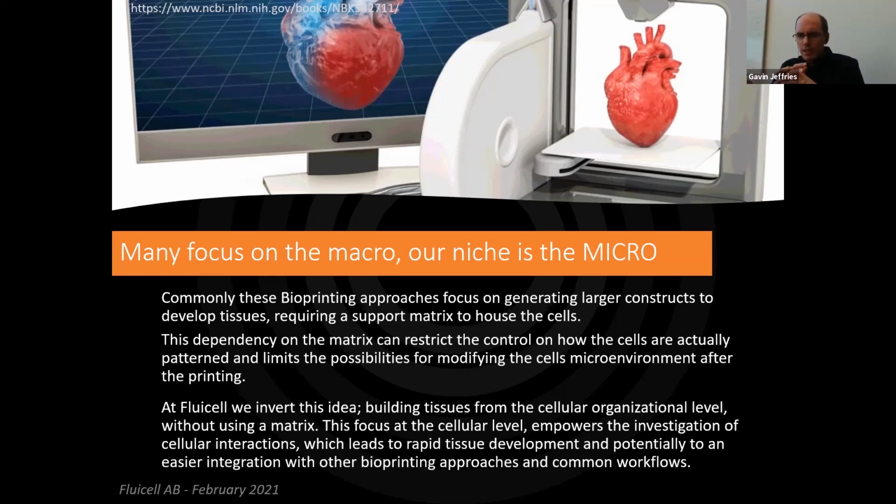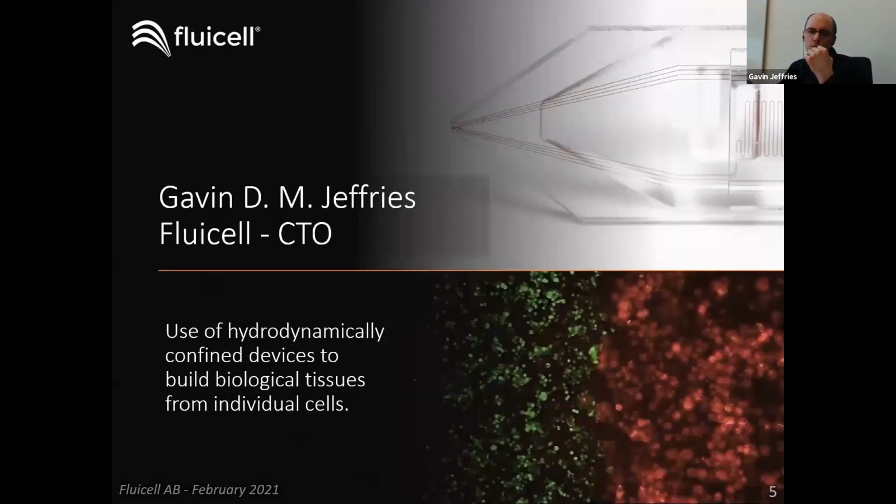What we really focus on is that many focus on the macro, but our niche here at Fluicell is really this micro patterning, so we can build tissues from cellular building blocks. As was described, my name is Gavin Jeffries, and I'm the CTO here at Fluicell.